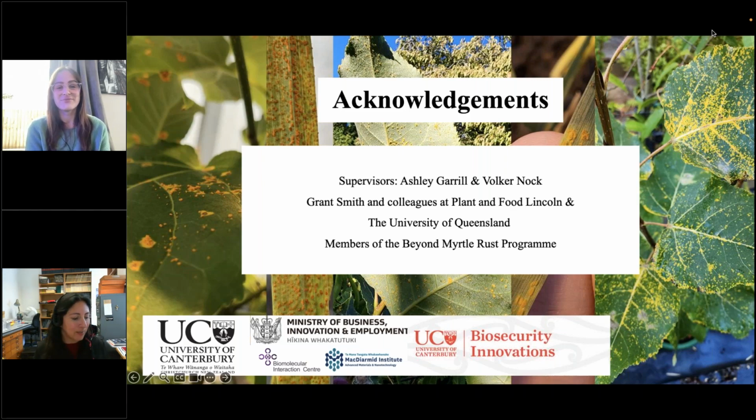Awesome. Sounds good. So the other thing that you had mentioned was having the multi-layer surface to grow these spores. What other sorts of things would you like to layer, the agar over the PDMS, or are you thinking of other sorts of layers to put on them? Probably not the PDMS, because it doesn't actually have any real nutrients and it's quite stiff, so they can't grow through it, but possibly just different layers of agar-based media, so even different concentrations.